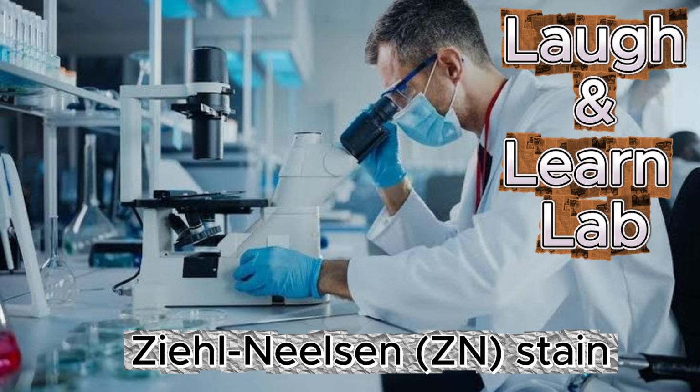The procedure begins with preparing a thin smear from the specimen. The smear is air-dried before heat fixation. Heat fixation helps attach the specimen firmly to the slide.